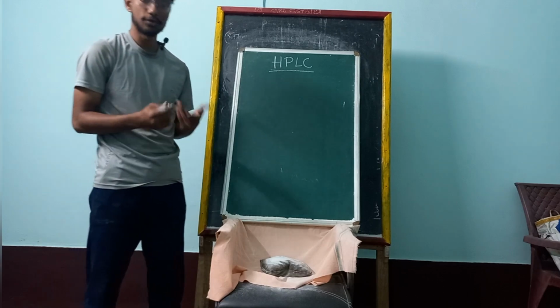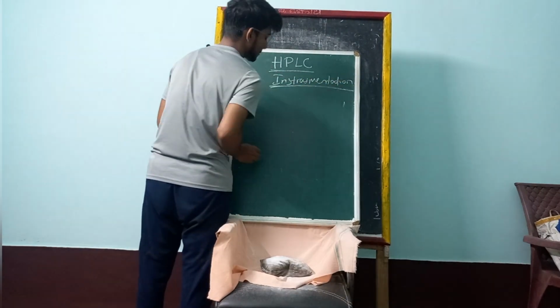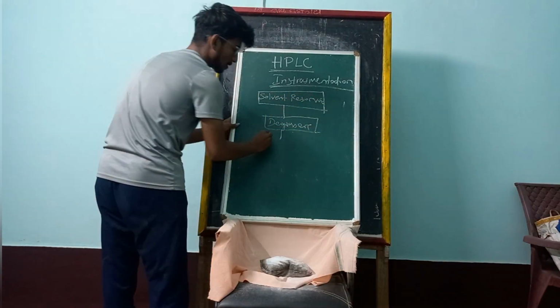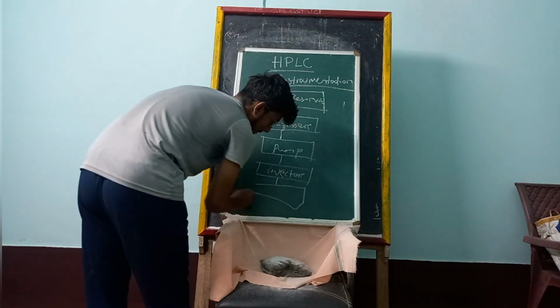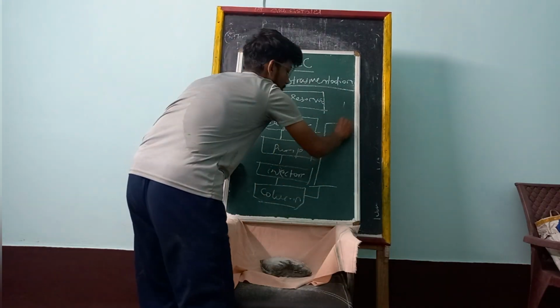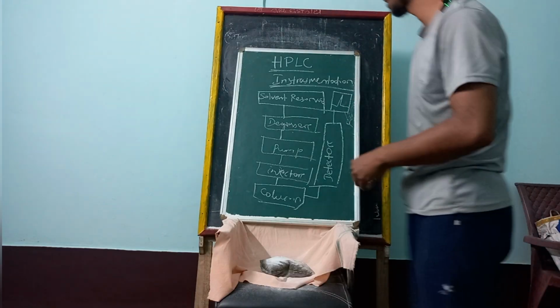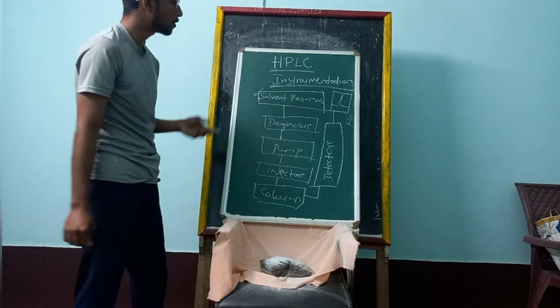Now we are going to the instrumentation part. First comes the solvent reservoir, which stores the solvent.